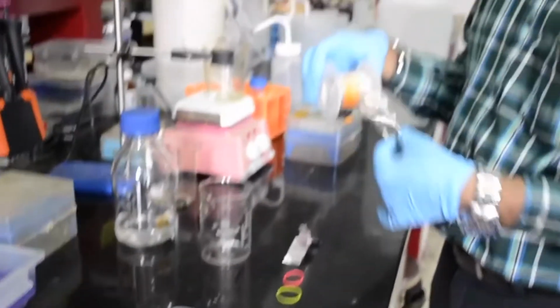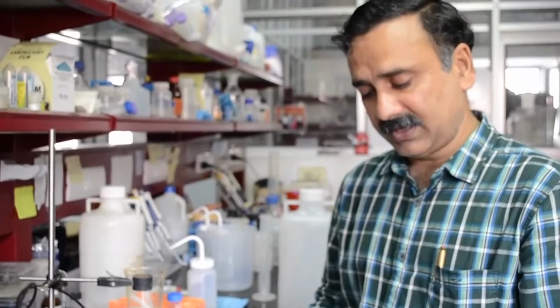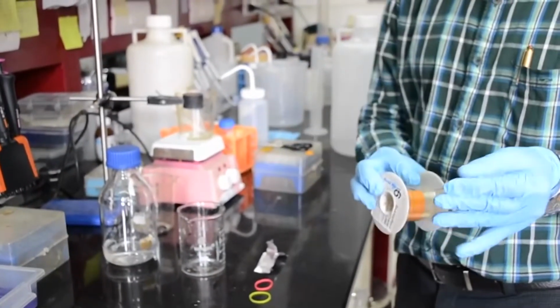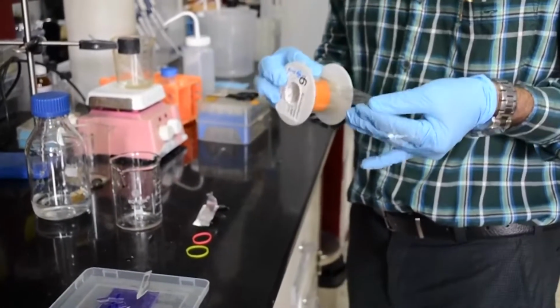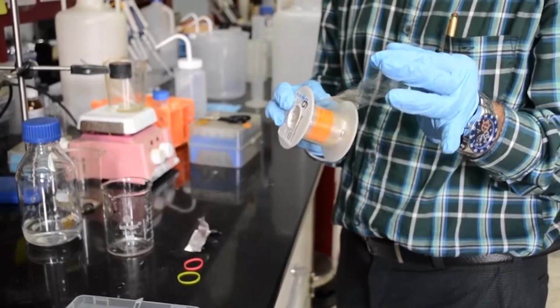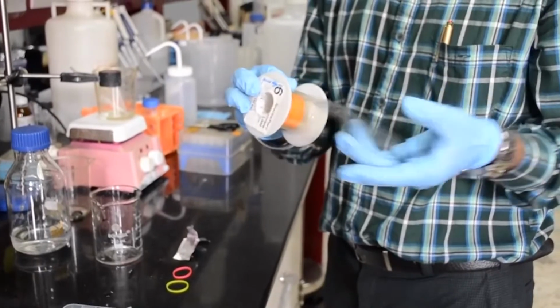Once you have cut the block and your block is ready for the electroelution, in the second step you have to prepare your dialysis membrane. This is a typical dialysis membrane that we use in the laboratories. It looks like a plastic kind of thing, but it is not plastic. It has two folds, or two slips, but they are stuck to each other.